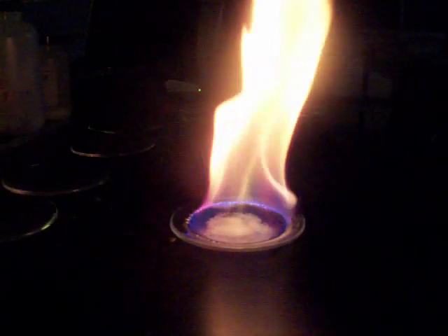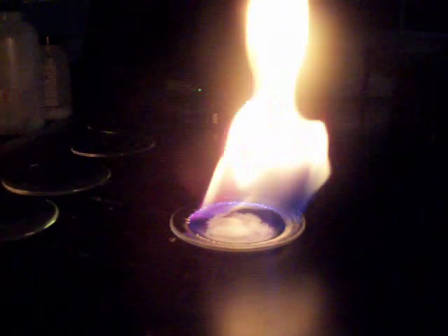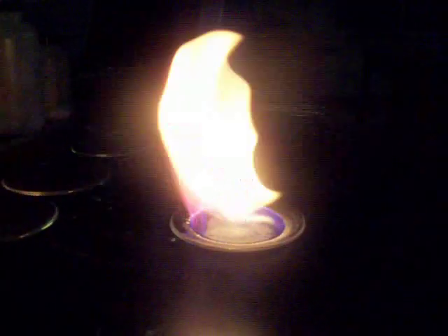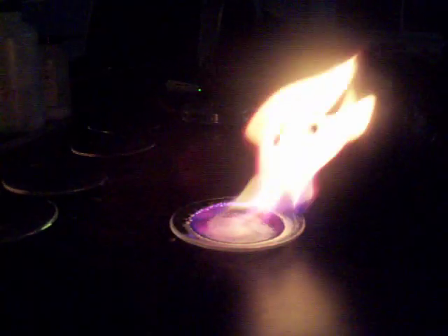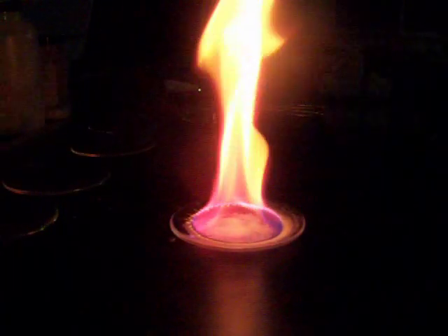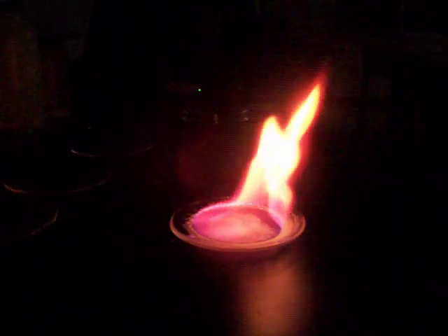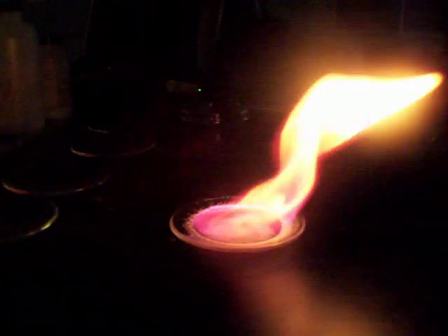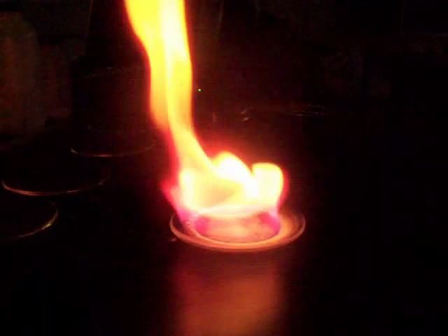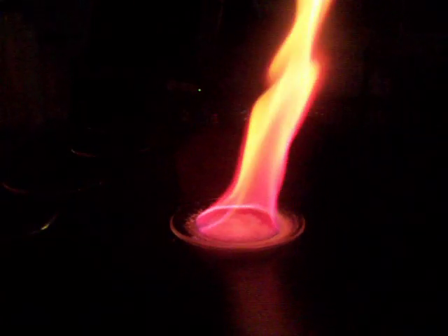Just like the spectrum tubes the other day, we excited those spectrum tubes by electrocuting them — by running electricity through them — and we got the color of the gases in the tubes. Here, we're exciting the atoms by heat. Instead of adding electricity, we're adding heat in the form of fire, which causes the electrons to jump up to another energy level, and then as they fall back down, they're giving off the colored light.